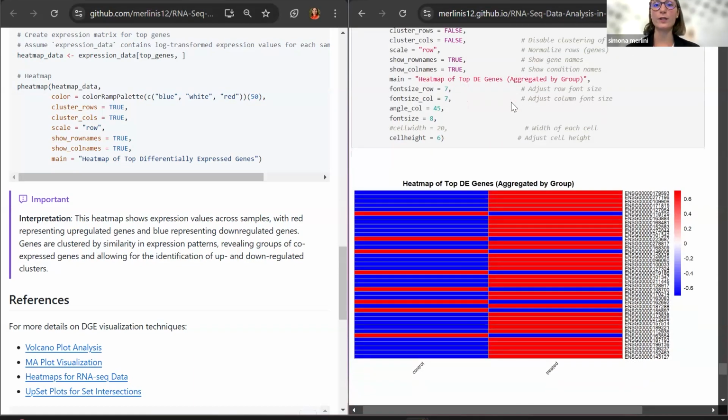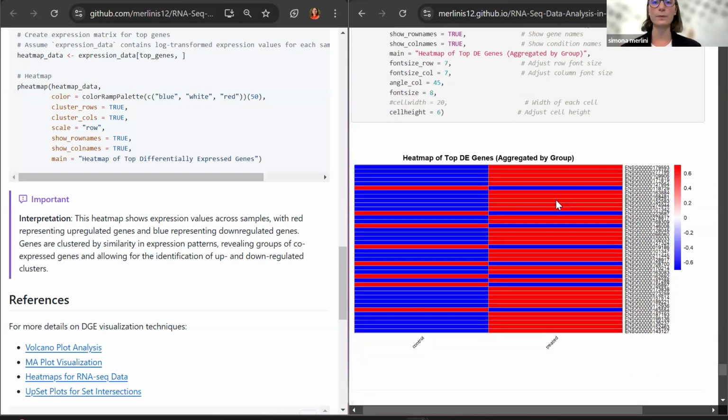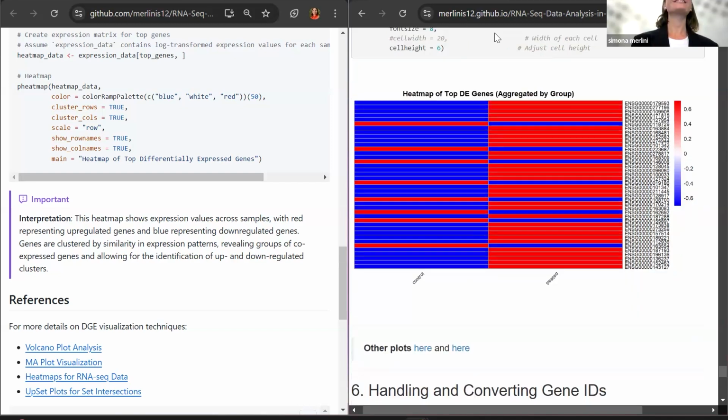And don't worry if you haven't seen any fancy application of these analyses, because in the next workshop next week, we're going to discuss some of the nice applications that you can do with this information. And that's it. Yes, we are going to see KEGG both in R and also some tools that perform KEGG analysis just without coding. Okay, thank you.